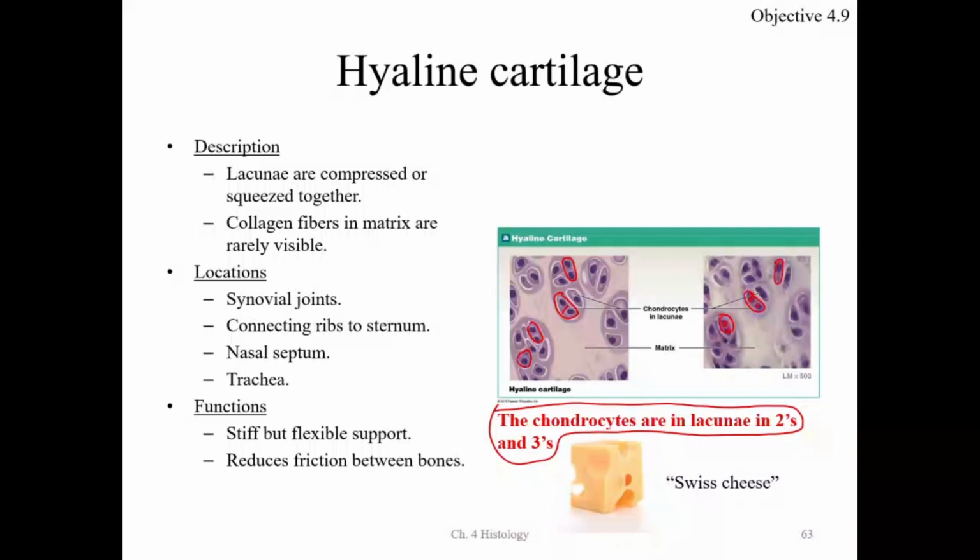One of my students said it looked like deer hooves. Looked like deer hoof prints. Look at the hoof prints of deer. The lacuna kind of look like hoof prints of deer in the snow or in the dirt. Deer leaving hoof prints.